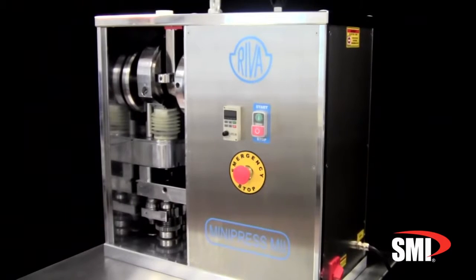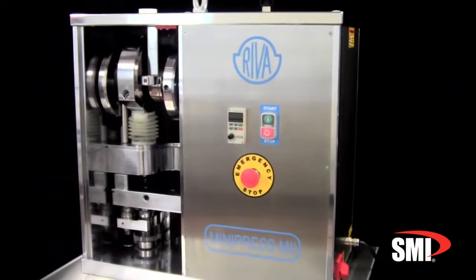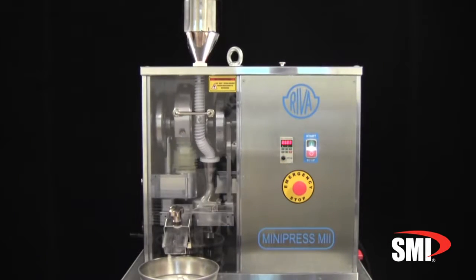The SMI RIVA MiniPress is a powerful 6-ton single station eccentric tablet press capable of producing tablets manually or automatically up to 6,000 tablets per hour.